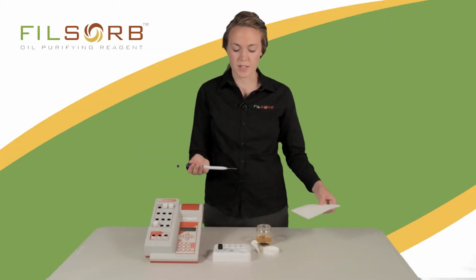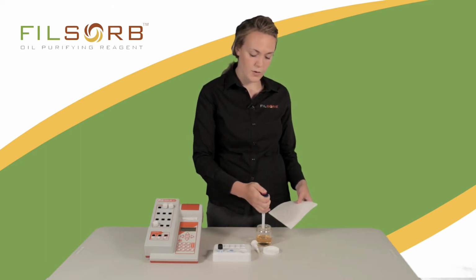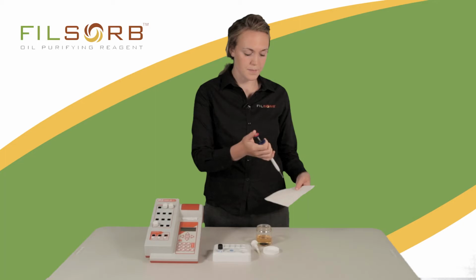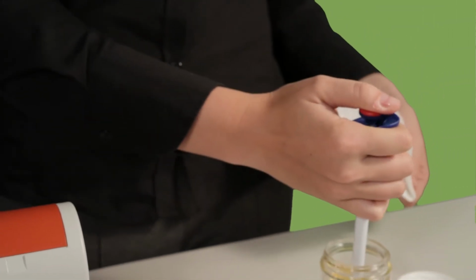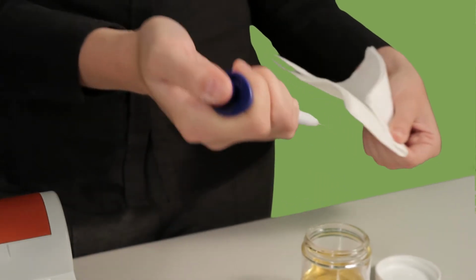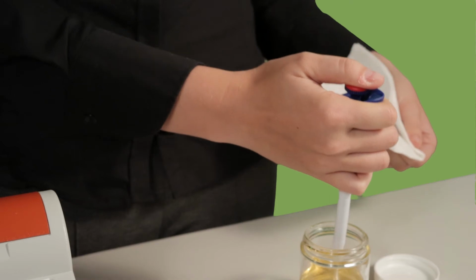You can change the amount that you wish to select by twisting the top of the pipette either way. Before you take your sample, you need to clean the tip of your pipette. You will do this by inserting your pipette into the oil, sucking up a small amount, and discharging it on a napkin. You will need to do this at least 5 times to ensure there is no excess oil from previous tests left in the tip.